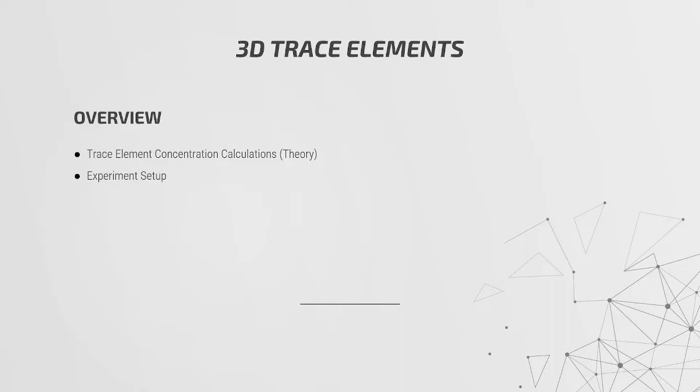And I'll be talking a little bit about the ideal setup that you might want to use with this DRS. I'll also be talking about how we construct our 3D calibration curves, or actually surfaces. And then we'll look at different ways to normalize our data, taking into account yield and those sorts of things, looking at internal standards and some normalization.